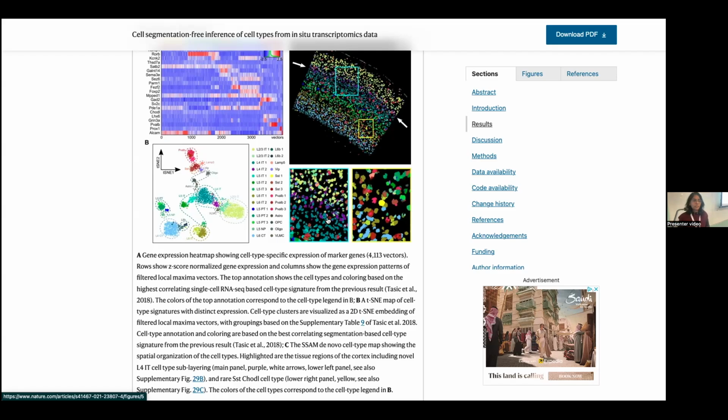You can have a large scale and it should be able to smooth things out because it's predictive. It's statistics. It will statistically compute as it moves and averages out using the kernel, and it will plot out the peaks of gene expression and where your cell centroids are. So I think this is worth exploring, even though we won't be doing it for the workshop.